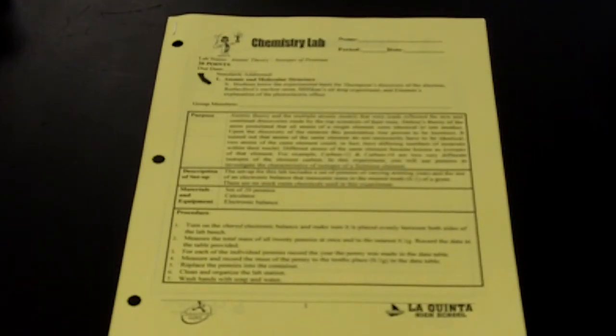In this experiment, you will use pennies to investigate the characteristics of isotopes of a fictitious element. The setup for this lab includes a set of pennies of varying minting years and the use of an electronic balance that measures mass to the nearest tenth of a gram. There are no stockroom chemicals used in this experiment.